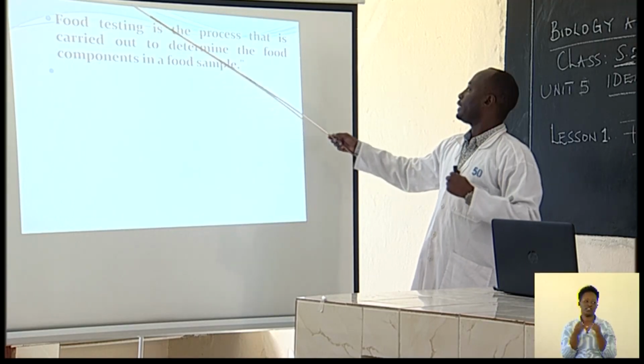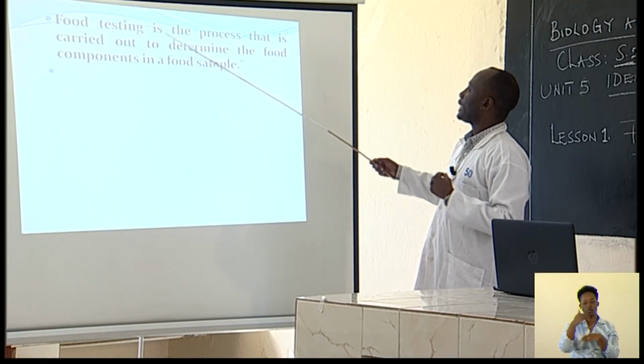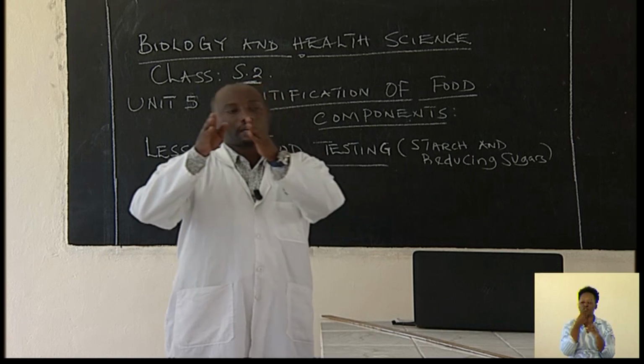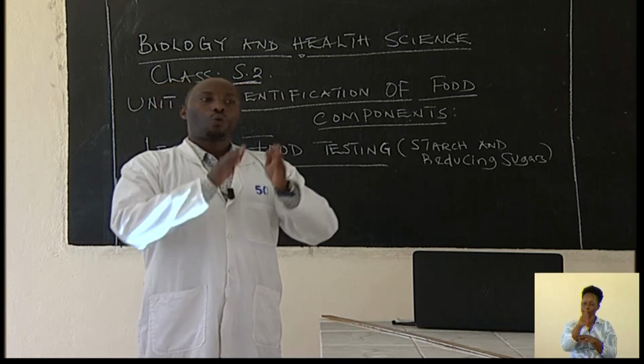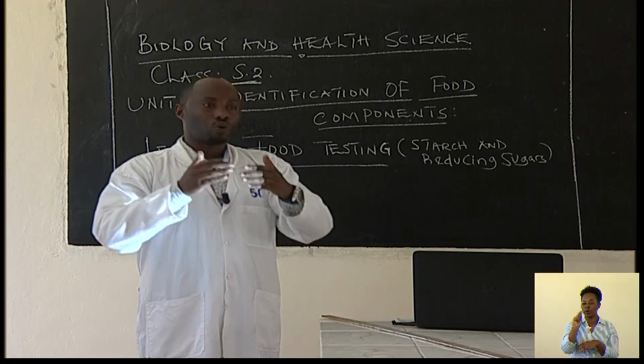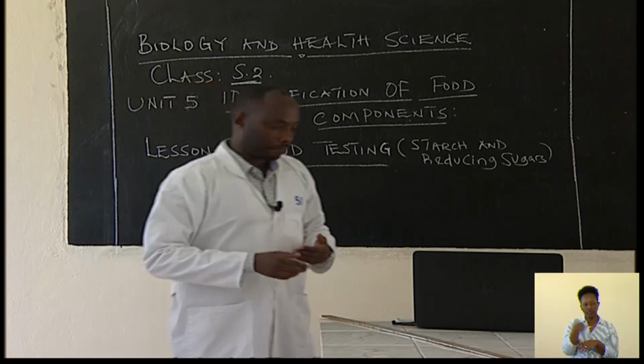So this is the definition of food testing: the process carried out in the laboratory to determine the food components in the food sample. What are the food components present in the food sample? Why do we say these are carbohydrates? Student, why do we say these are proteins? That's why we have to do what you call testing.